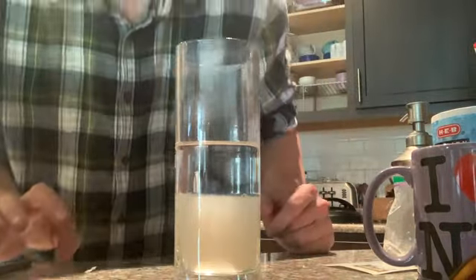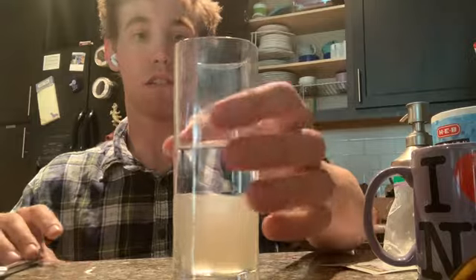All right, welcome back. I'll just get back down here. I don't know how well you're gonna be able to see it, but I can just start to see the little clumps of DNA rising up along the surface of this. It's really cool. Yeah, let me see if I can keep my hand out of the video and try and pull these up a little bit. So let's see here. You see those little clumps coming up? That's actually the banana's DNA.